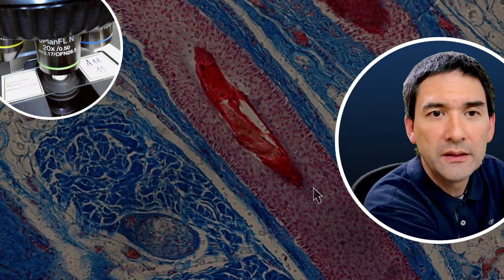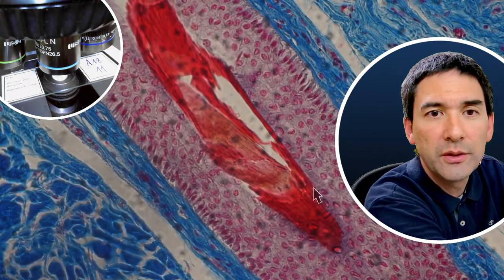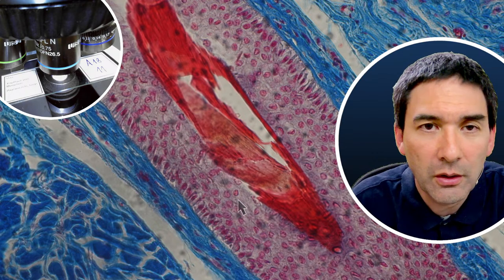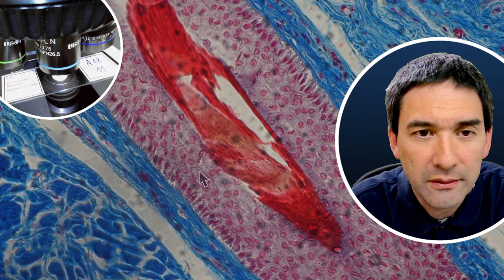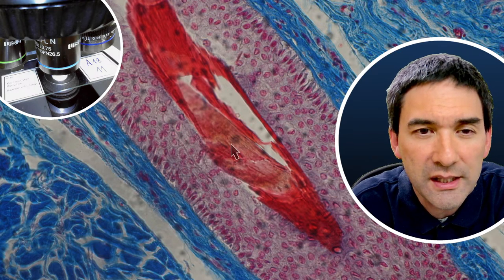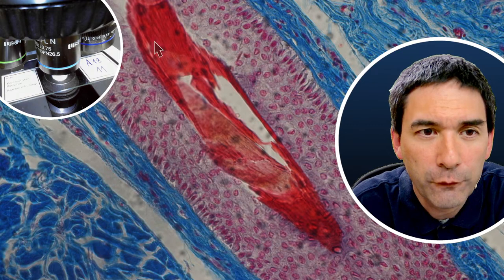So we zoom in a little bit, turn up the brightness a little bit, and then we can see the following. We can see that there are, of course, individual cells here. You see the small circles are the nuclei, okay? And this here in the center, which seems to be the hair, is much more fibrous, and you do not see any individual cells, yeah? So the whole thing here seems to be the hair follicle, okay?